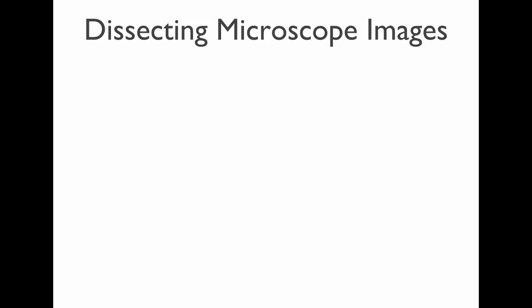Because this microscope has two eyepieces, it allows us to get a much better three-dimensional view. We can see the depth of what we're looking at. Okay? Two forward-facing eyes give us great depth perception. We've evolved to have excellent depth perception.